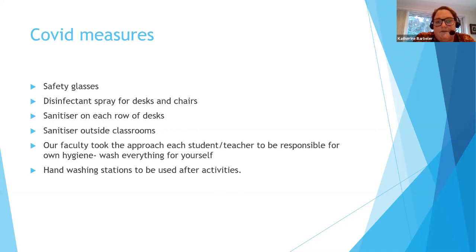This is unique maybe to my school. I think in most public schools, students don't have their own safety glasses, so that's probably different to university. We have safety glasses for them and they always wear them for experiments, but therein becomes a contamination issue because in period one one set of students are wearing them, in period two another. We thought long and hard, what do we do here? Do we clean it for them?